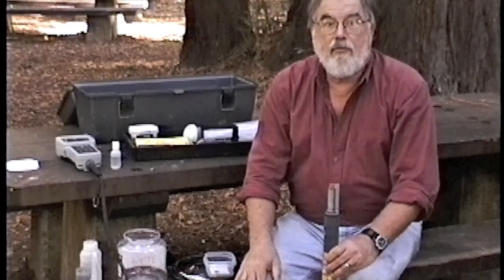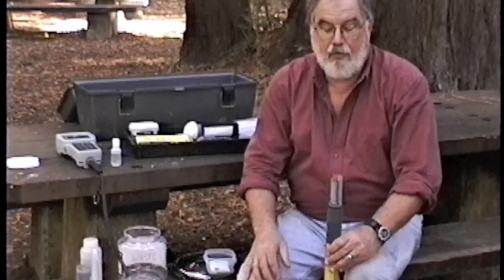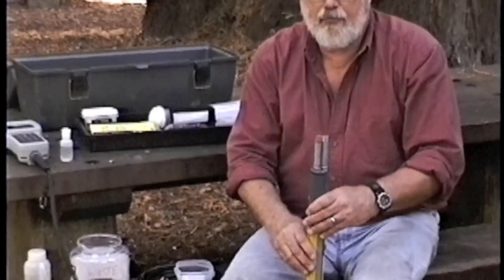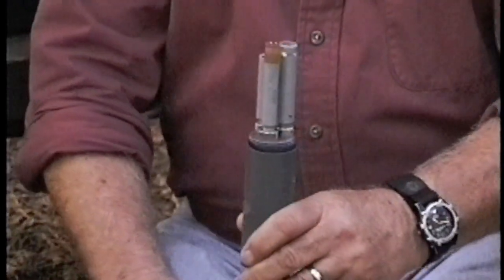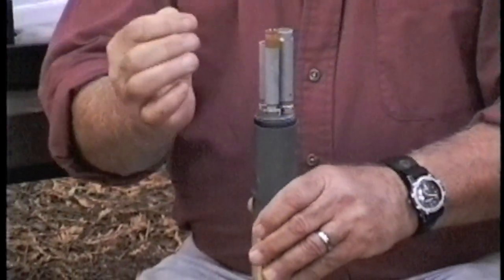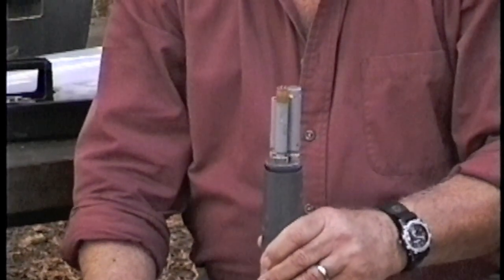Now I will demonstrate how to install a dissolved oxygen membrane on a YSI 600 XL dissolved oxygen probe. The probe from the manufacturer is clean and dry. You can see the probe here with the two shiny electrodes. What we need to do is put an electrolyte in the probe. The probe has a slight recessed area and that area will be filled with electrolyte.